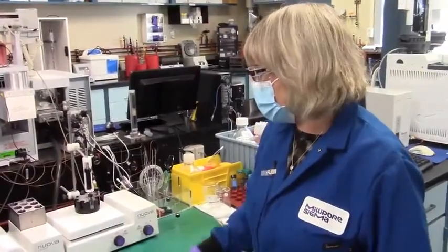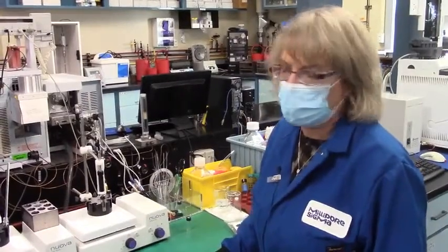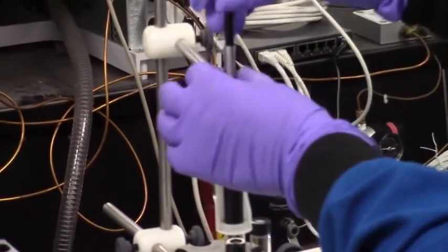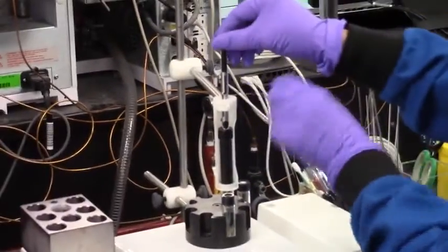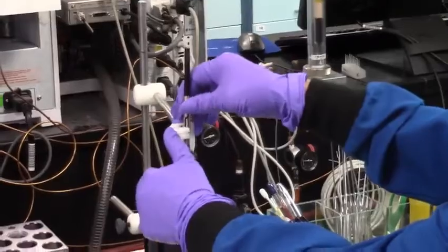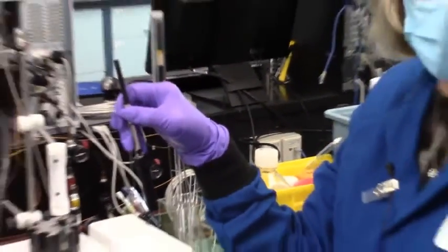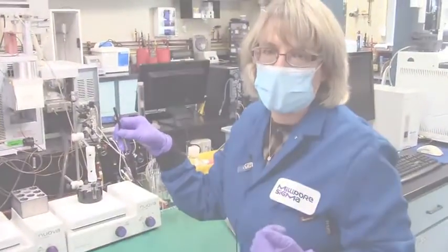All right, so the extraction time is up, and we're ready to go ahead and take the fiber out of the sample and desorb it in the GC-MS. So we're going to retract the fiber back inside the protective needle. So right now the plunger's down, so I'm going to bring it back up and open up my holder so I can pull it out and just take it right out the top. And then we just walk over, and we're going to repeat the process but into a GC inlet.